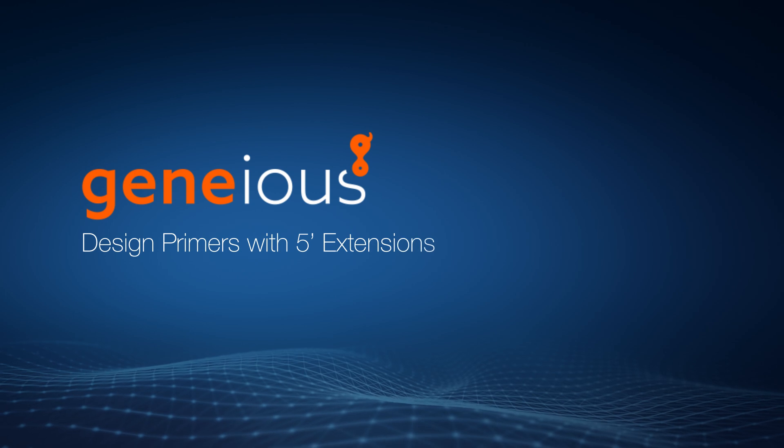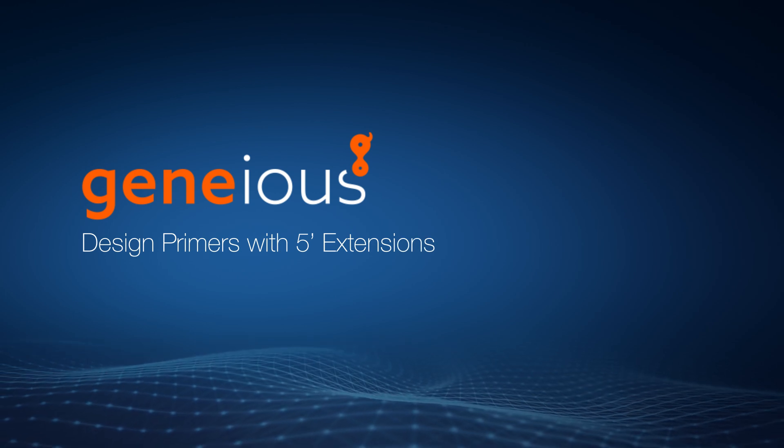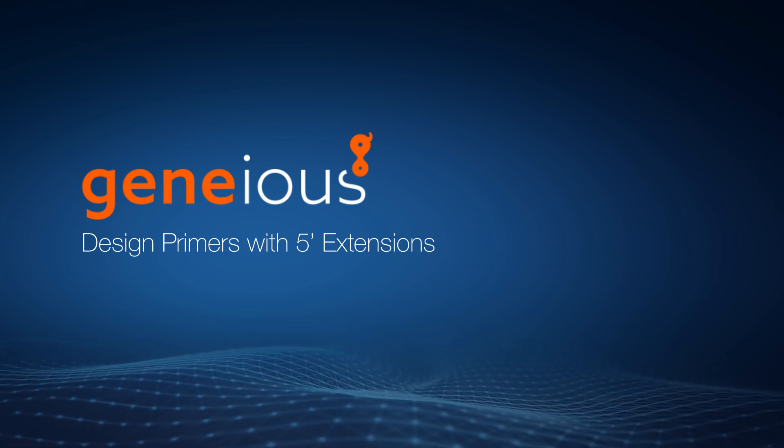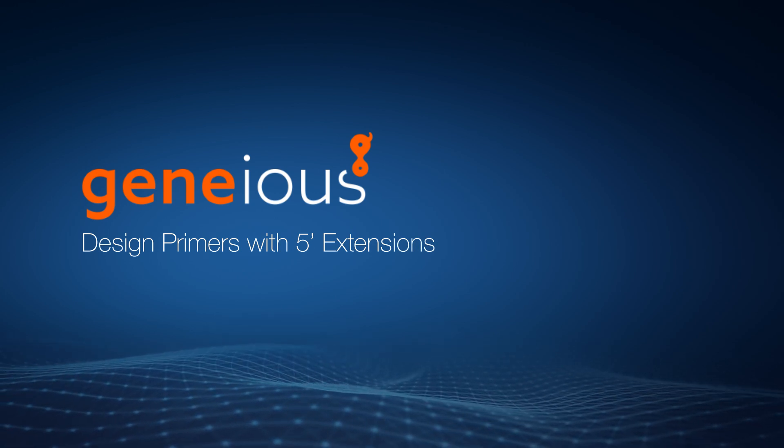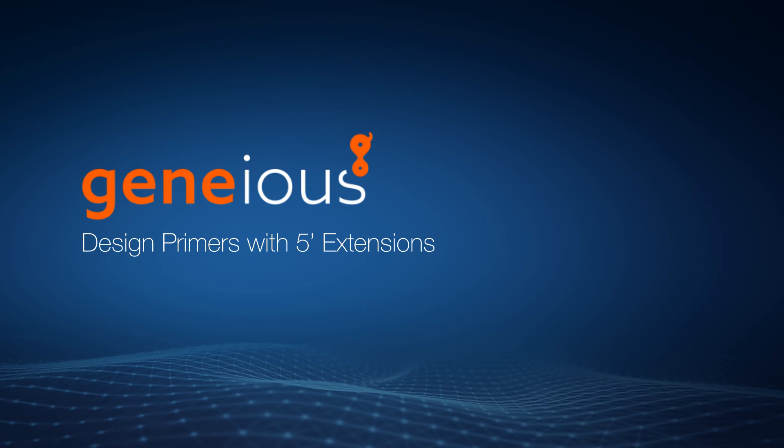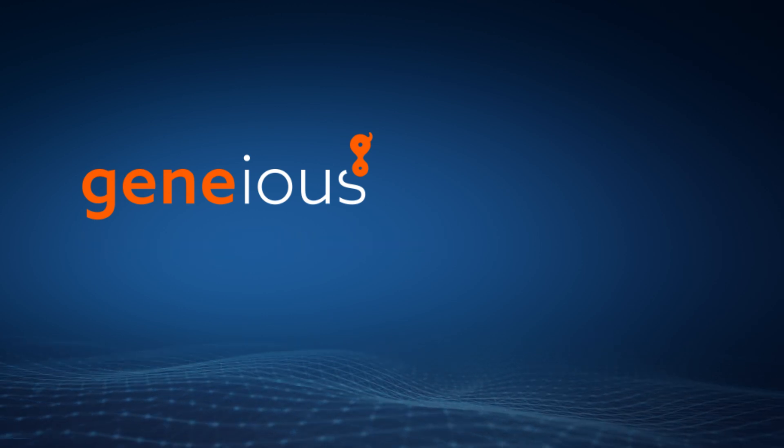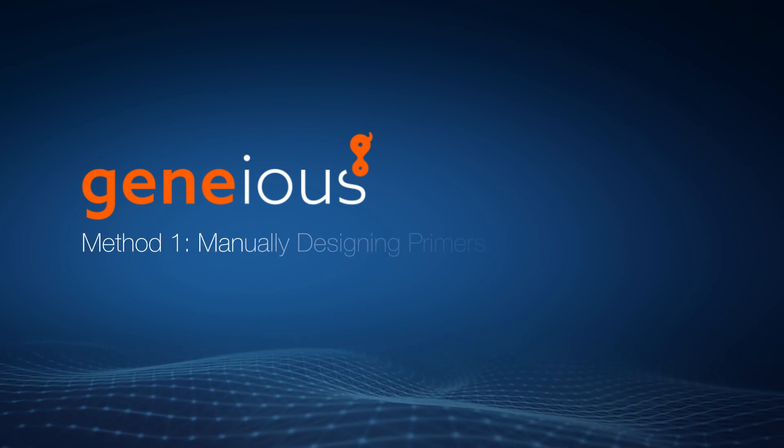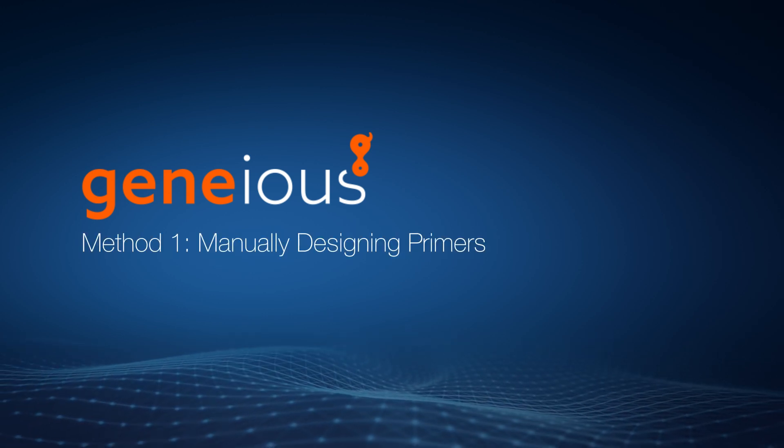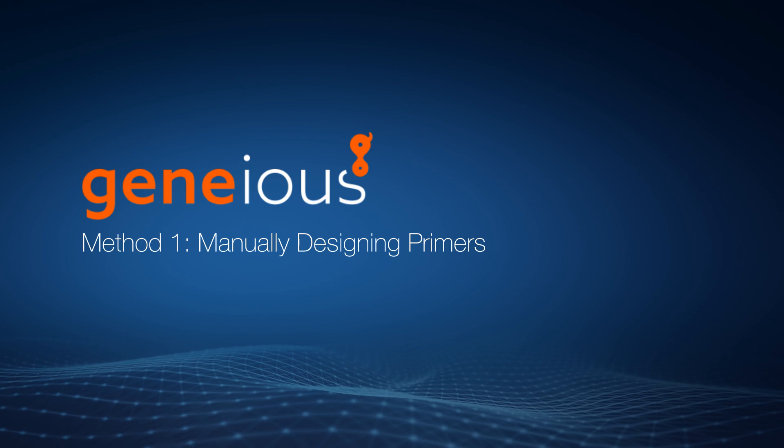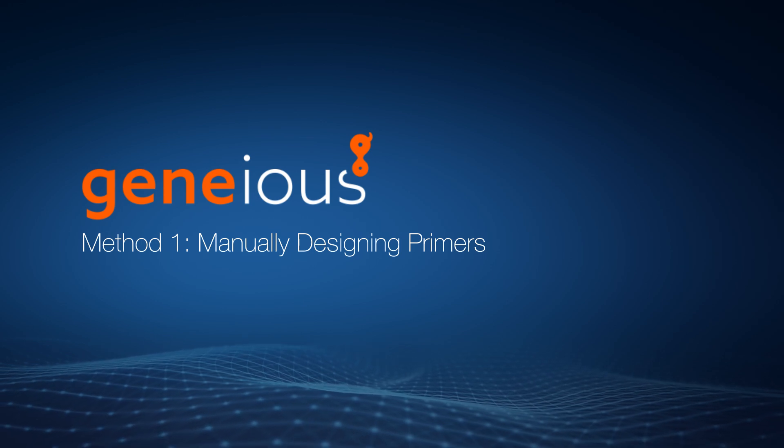Welcome to this video on designing primers with five prime extensions in Geneious Prime. Let's start by looking at how to add five prime extensions when manually designing primers.